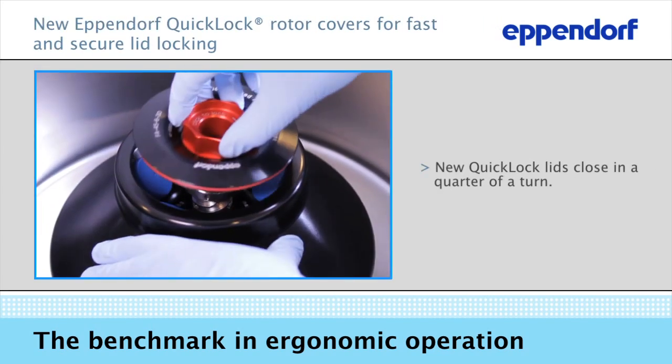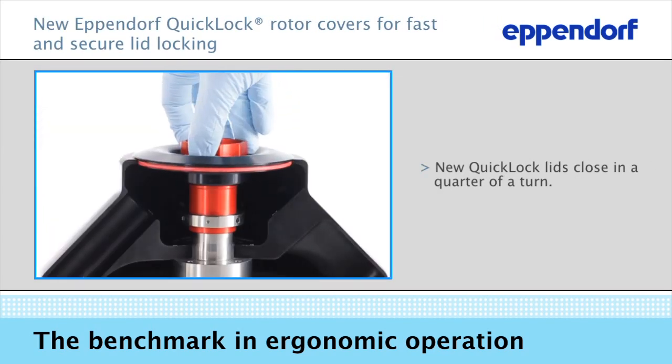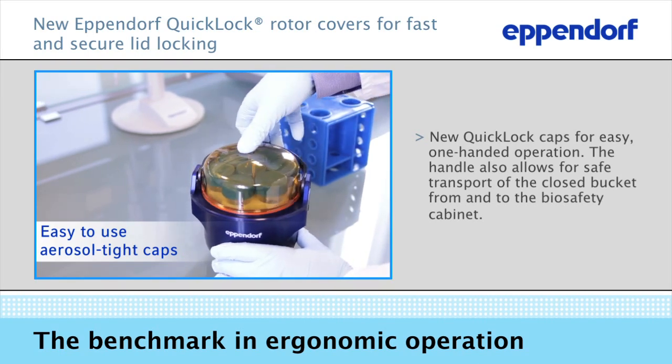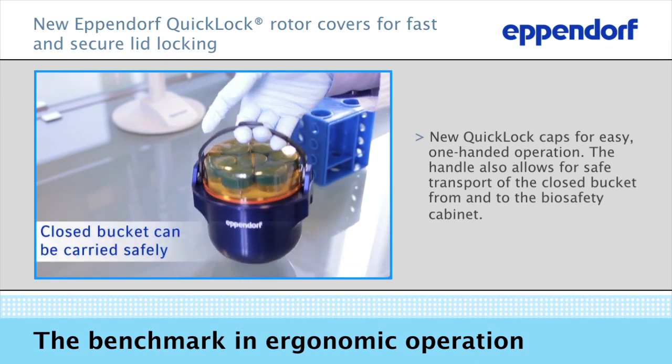The new quick lock rotor lids and caps allow fast and ergonomic lid locking. The handle allows the closed bucket to be carried safely to the centrifuge or the biosafety cabinet.